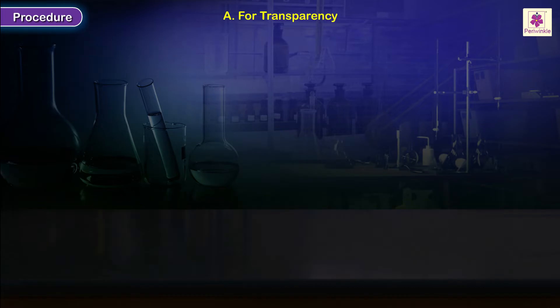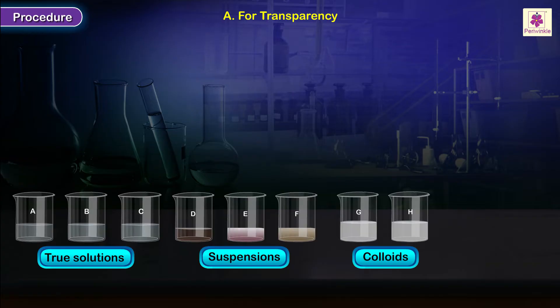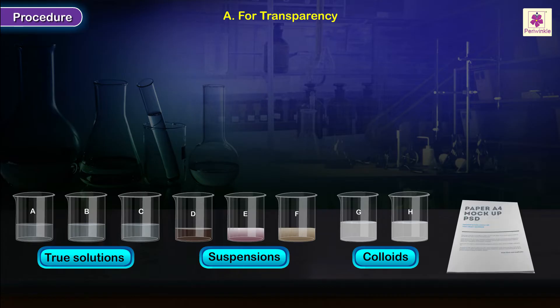For transparency, take all three types of mixtures in labelled beakers and put each of them above a printed paper.